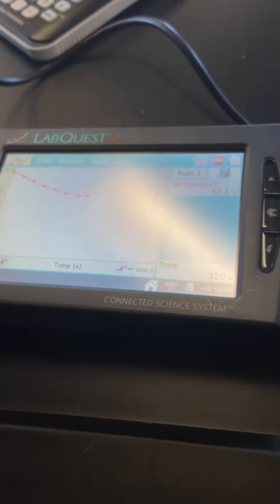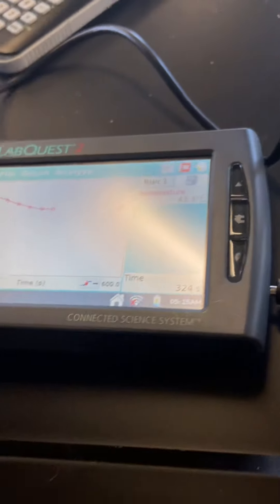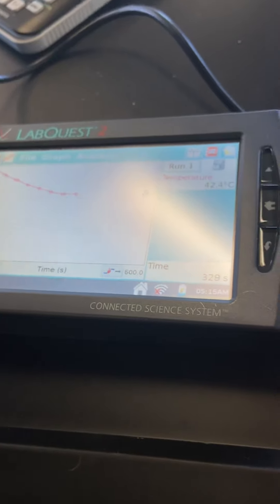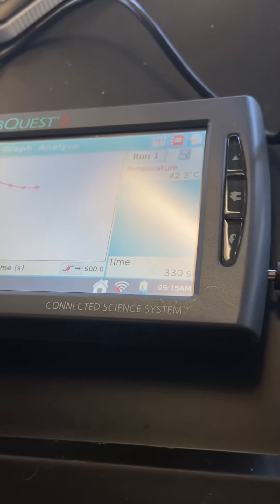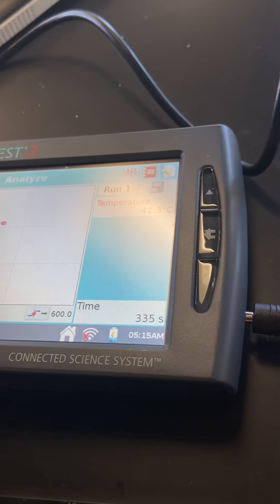I don't think it's dropping anymore. Does it feel like there's more liquid in the sample or does it feel like it's all solid? It feels like it's all solid. One thing I'm noticing in the data is it seems to be plateauing, which is good. That's what it does when it reaches freezing.